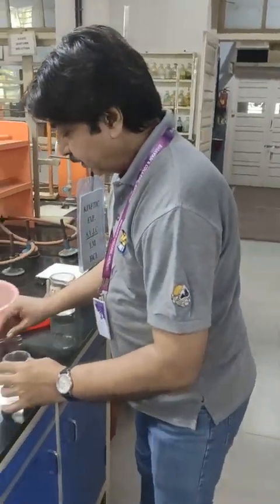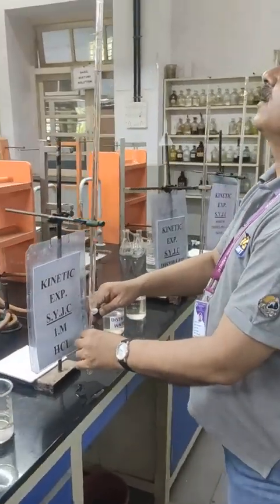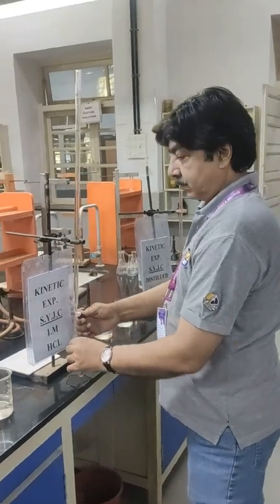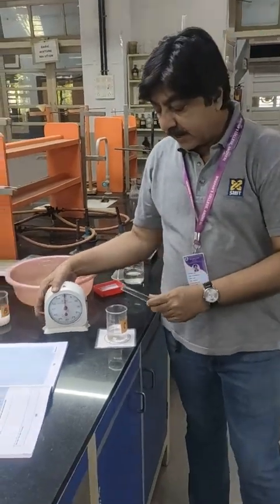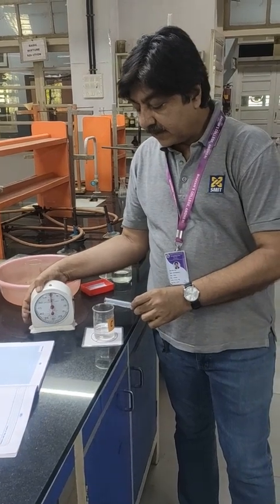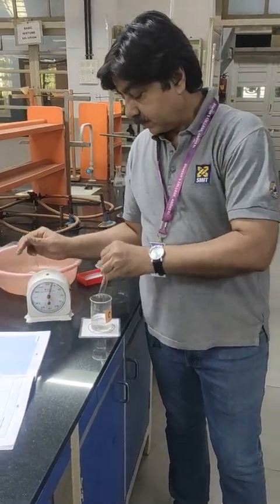So this is 40 plus 8, 48, and to this I shall add 2 ml of HCl. Now once again I have reset the watch, and now I am adding 2 ml of HCl and I will start the stopwatch.